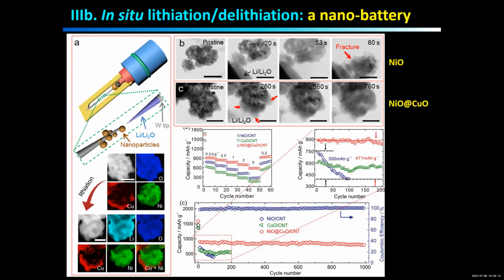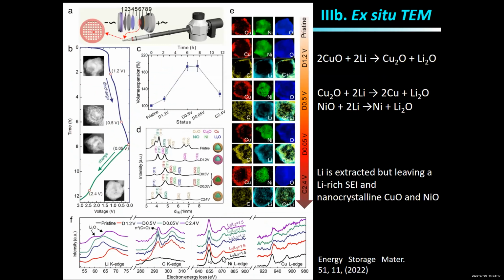Then we need to understand this different volume expansion behavior. To do that, we first probe the lithiation mechanism for this material. We prepared this special coin cell, which includes a TEM grid loaded with active material. Then we measure the voltage profile for the discharge-charge cycling. The voltage plateaus indicate intermediate reactions, so we stop at these voltages and take the TEM grids out for ex situ TEM observation.